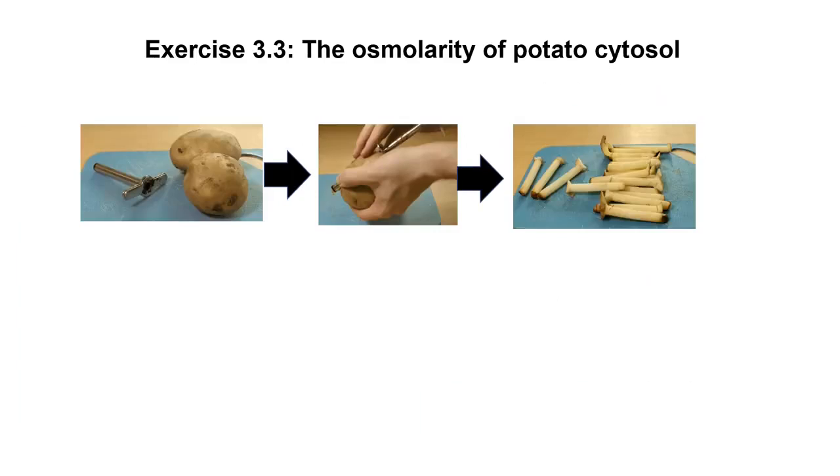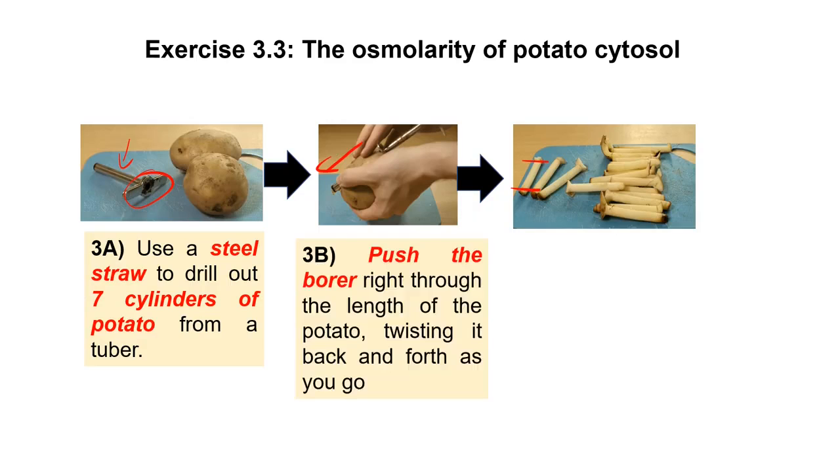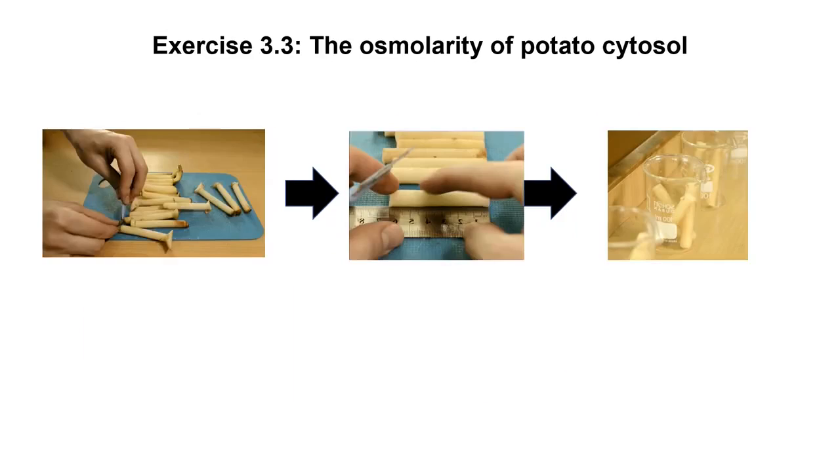So as I said before, and maybe you're watching the video, we are going to give you this type of tubing, this type of tube that allows you to make the hole. They are not exactly going to have this, but it's the same principle, and later you just have to cut the last sections with a razor. So as I said here, use the razor to make them the same size and then put them inside the liquids with the sugar.